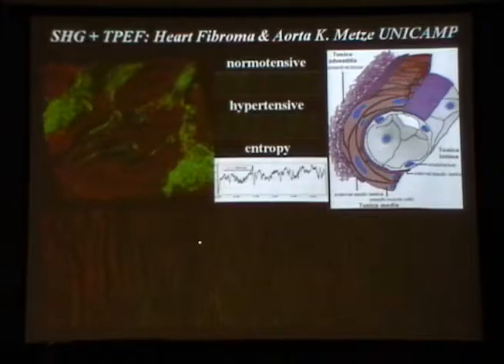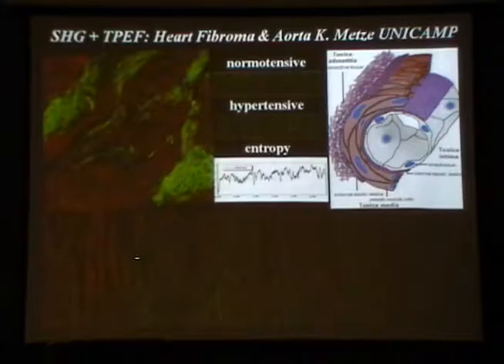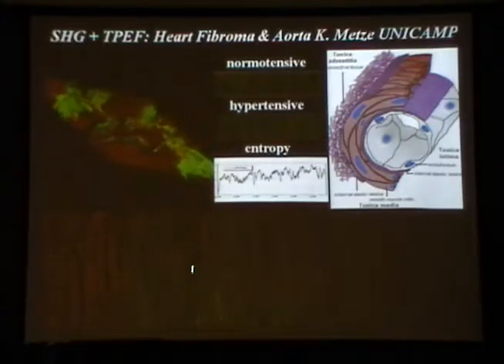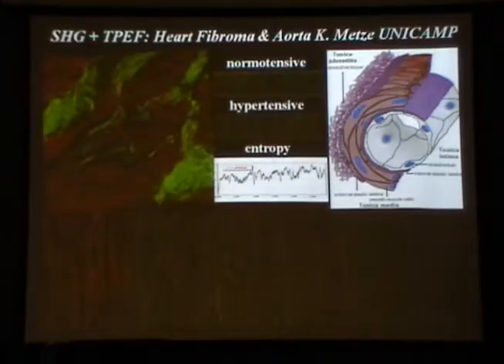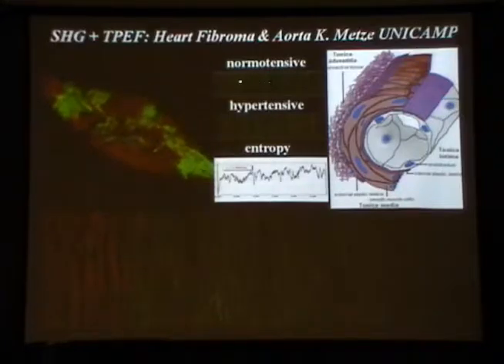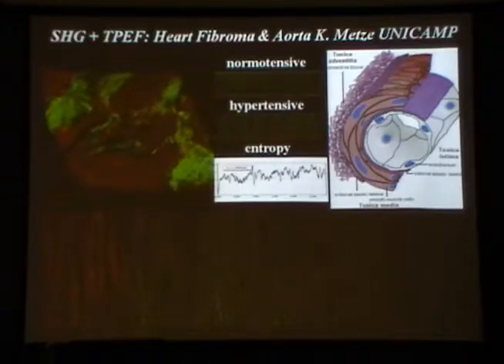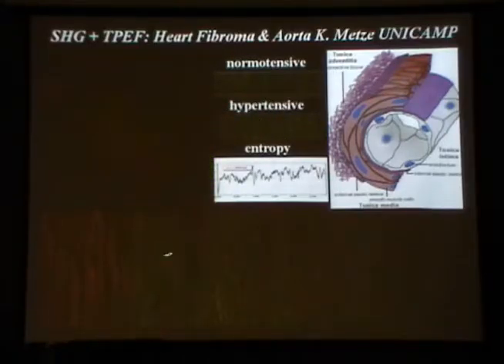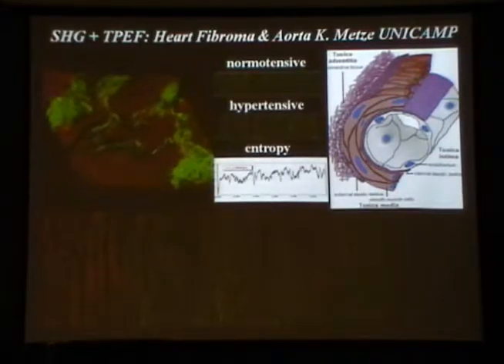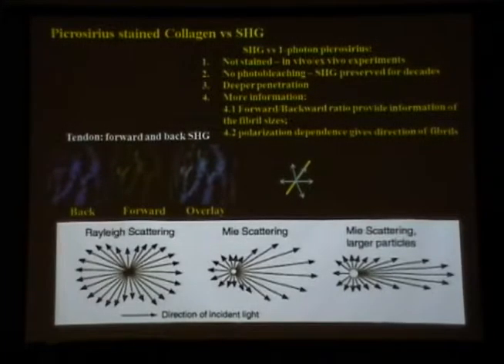Here are the images of the aorta, taken from this position to that position there. And you can see with red, the second harmonic, those are collagen fibers. And the elastin fibers you can see with fluorescence, so you can see the green ones. And we can show this with people that have normal blood pressure, and hypertensive people, and we can actually use algorithms here, like construct entropy for each part of this and see the organization of those fibers, count the fibers, and so on and so on.